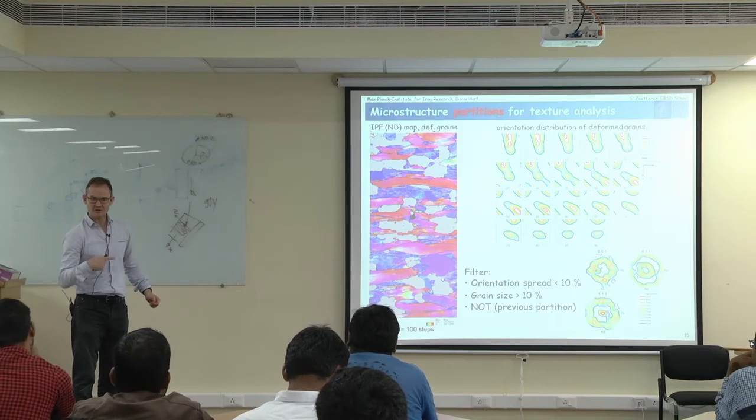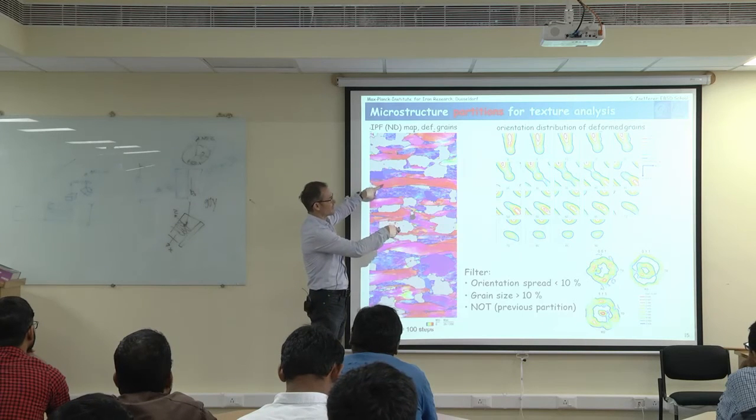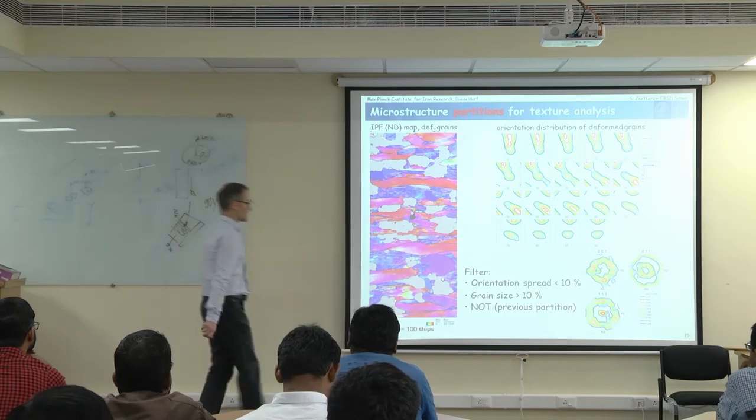You can now click into the microstructure, and I'll try again, and then you will see that only these grains, only these areas are lighting up. And then you click into the blue ones and you will see only these grains are lighting up. Oh, let's try that.